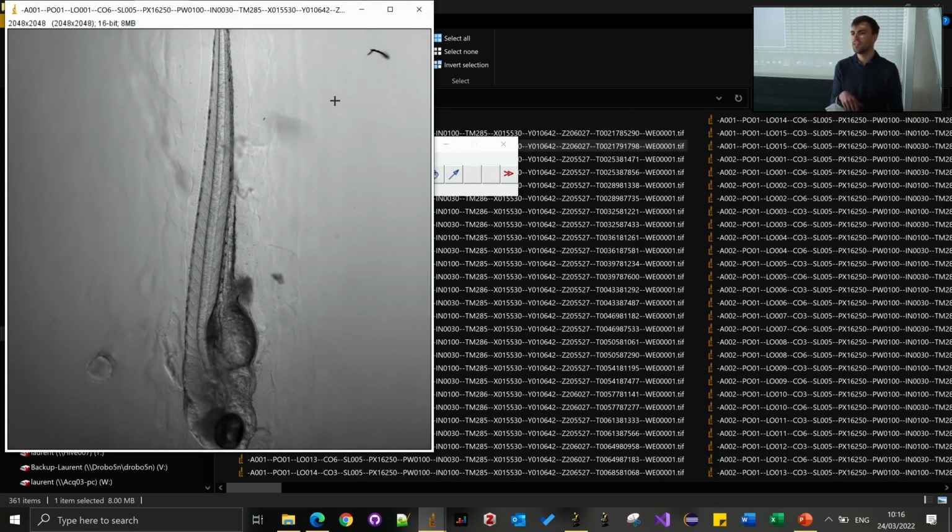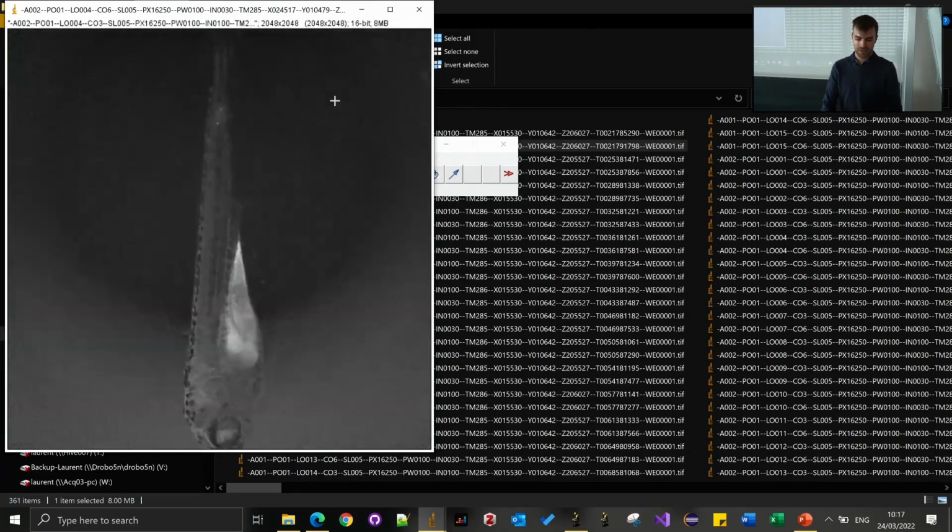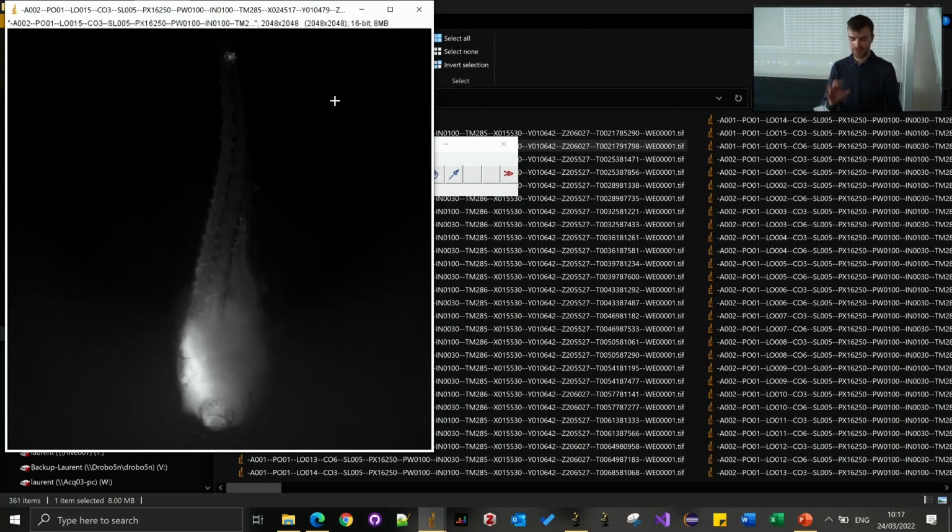If we look at the data, these are typically pictures you would have if you use the orientation tools that we have for the imaging machine. So these are zebrafish larvae, and they're oriented in an agarose gel. So they all have a rather similar orientation, and they're pretty much in the middle of the well. They're either vertical like this or more usually horizontal. For some reason, I have them vertical, but the idea is the same. So again, I can go through the data. It's a time lapse, and there are 2 channels, that's why there's this flickering.